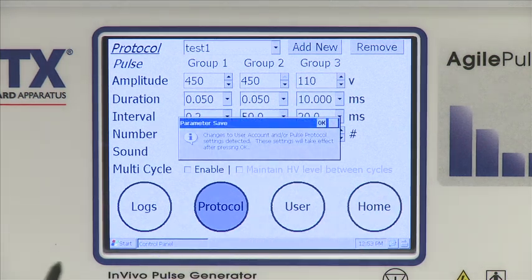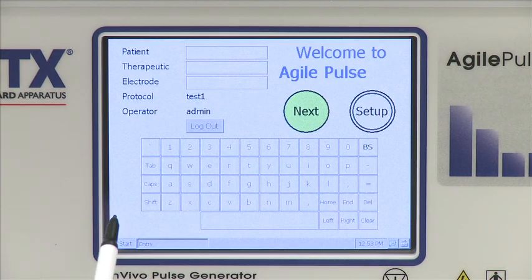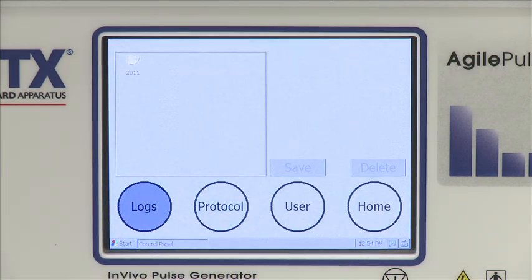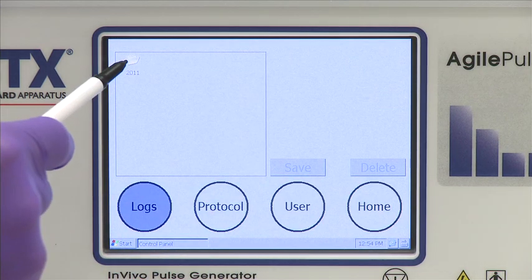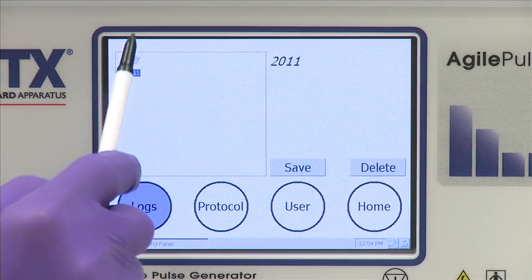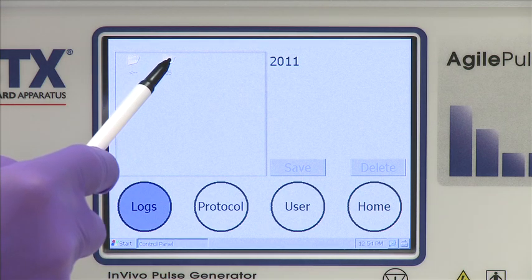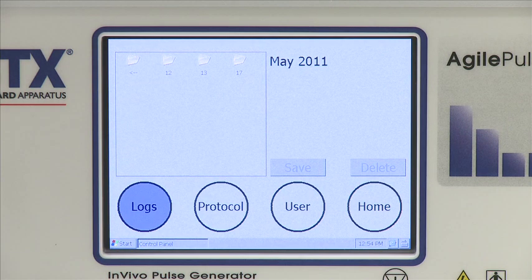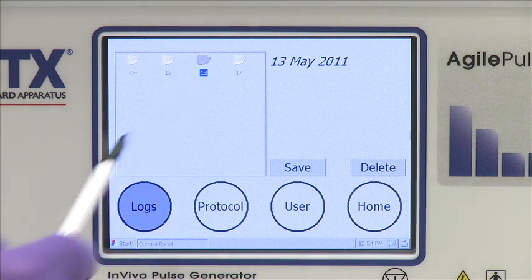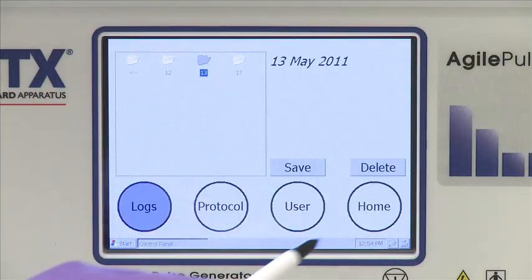Click on Home, then OK, and the program takes you back to the Home screen. Click on Setup again, then click on Logs. The folder icon containing all the saved protocols appears. Click on the folder, double-click on the appropriate subfolder showing the year, click on the folder that reflects the month the protocol was saved, then click on the appropriate folder for the day. To save, insert a USB key and click Save.